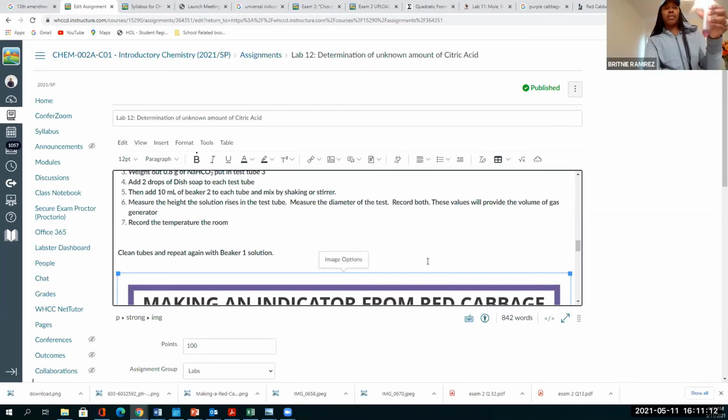Hey, Dr. Henry, how much of the cabbage solution do we put in the Kool-Aid? So you need about a mil or 2 in the Kool-Aid. And that goes into the main one, right? The main solution. And you can go ahead and put in the main solution after you've already done the experiment. That's just repeating it 3 times, right? Basically. Yep. Okay. All right, cabbage is now going.